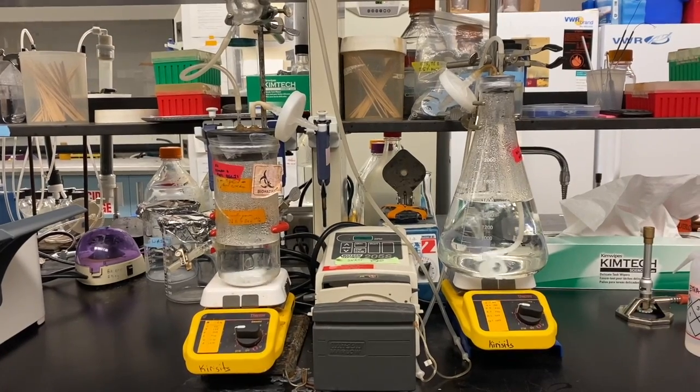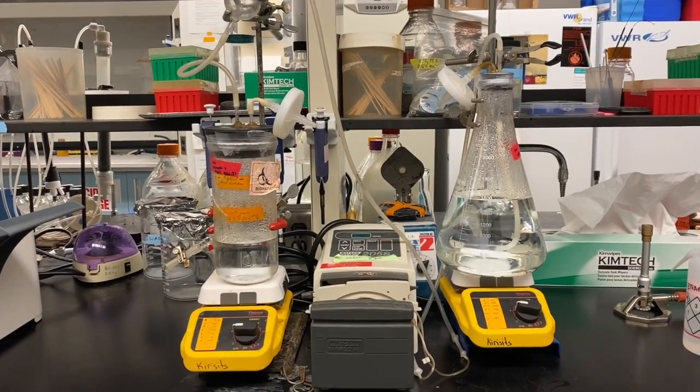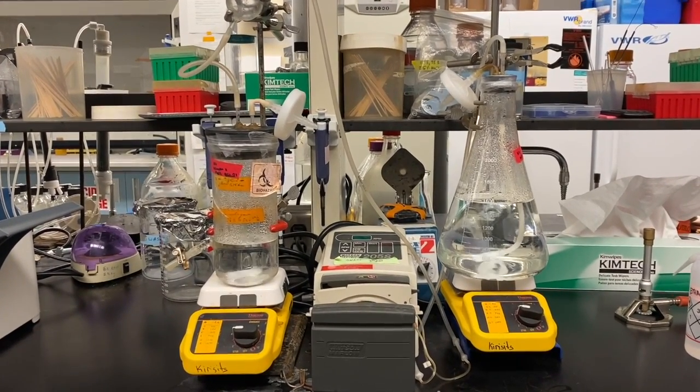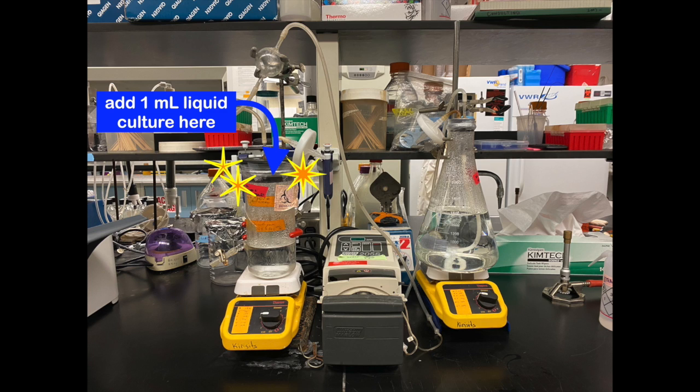After the chemostat has ran for 24 hours with media only, the growth chamber is inoculated with 1ml of the liquid culture sample we had just prepared. When adding the bacteria sample to your growth chamber, always use aseptic technique and flame the lid of the growth chamber. Remember to re-parafilm the lid of the growth chamber.